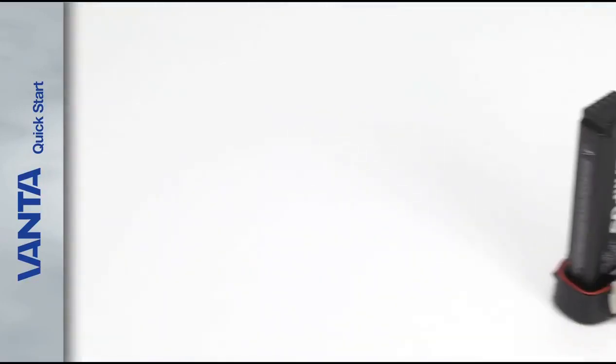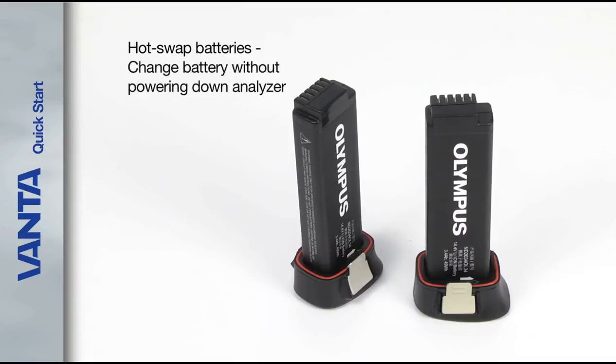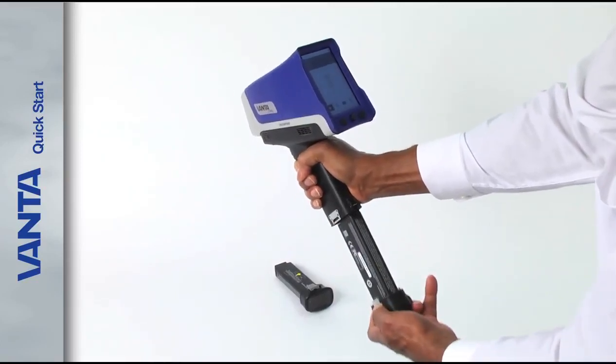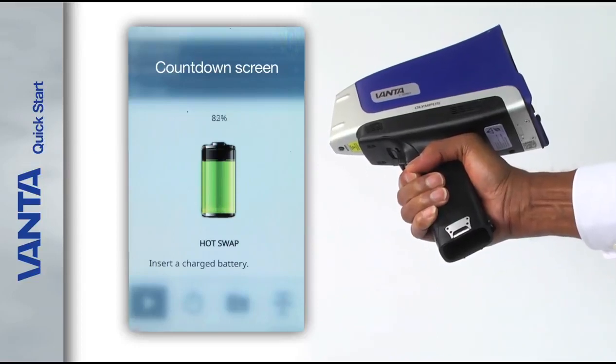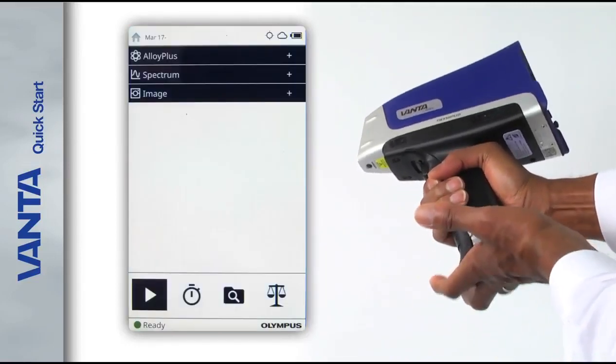All Vanta analyzers feature hot swap batteries, so you can change batteries without powering down the analyzer. To swap out the battery, remove the spent battery and insert a fresh one. A countdown screen shows you the power left in the analyzer, so you know how much time you have to complete the swap.